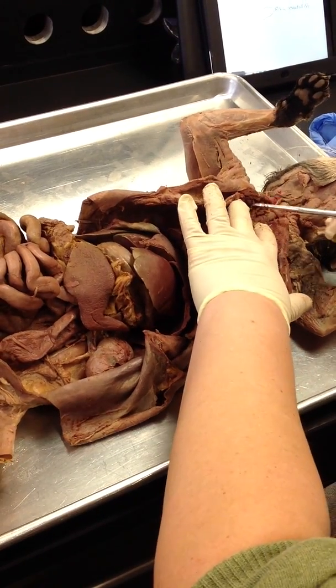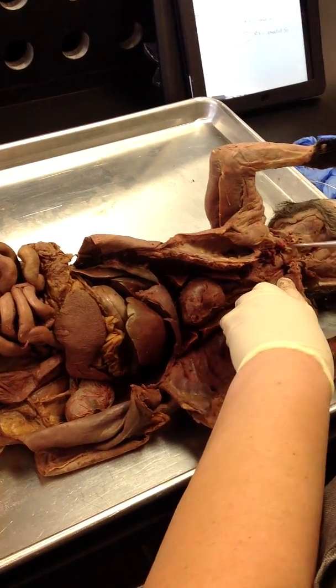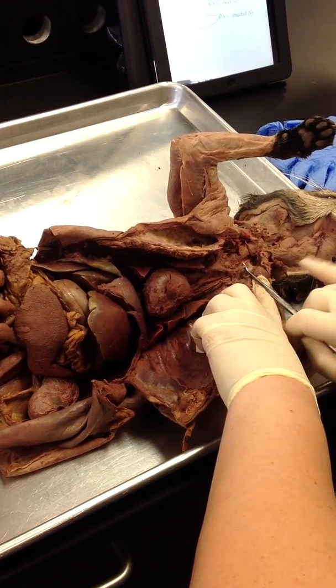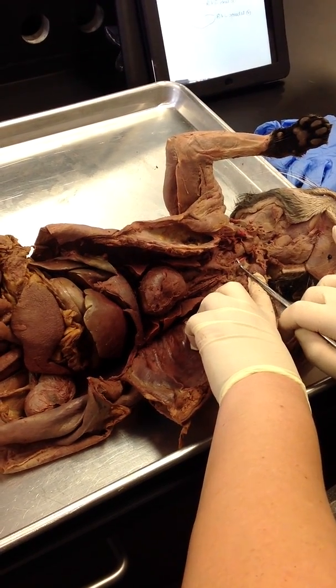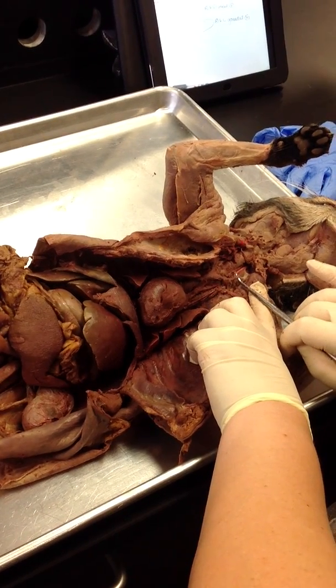Okay, and then it splits so that one piece... You can see it better on this side of this cat. So the piece that goes up is the jugular vein. What jugular vein? The left jugular vein.